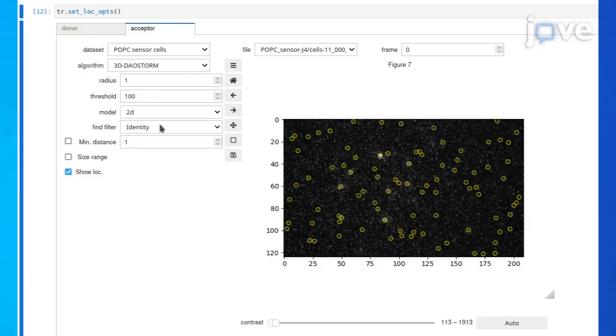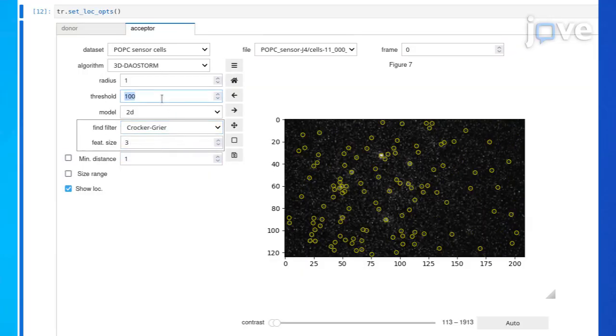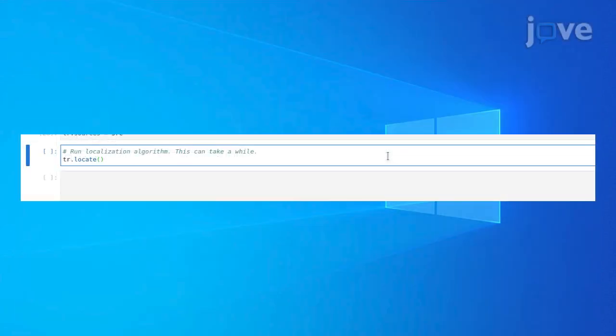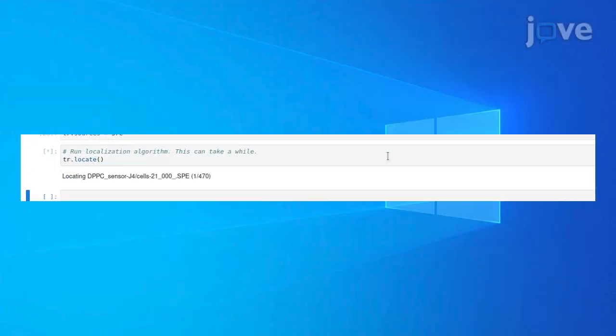Our method is compatible with a variety of different FRET-based probes. For example, it could provide insights concerning molecular forces, conformational dynamics, and binding kinetics in live cell experiments.